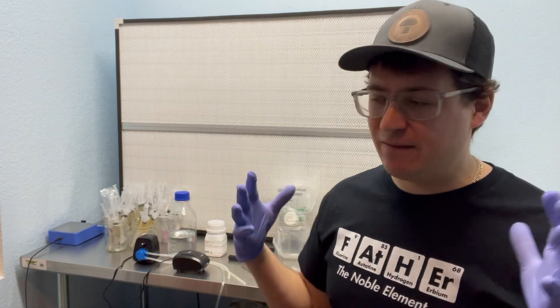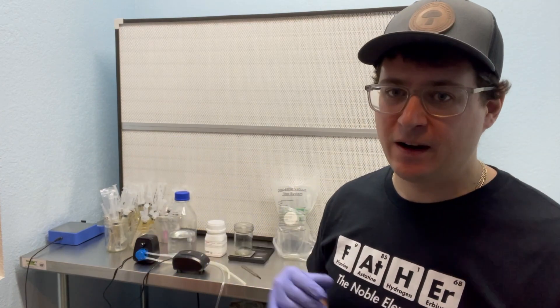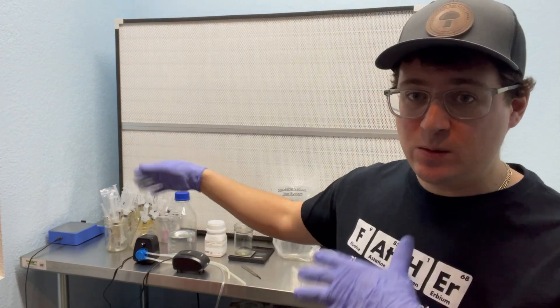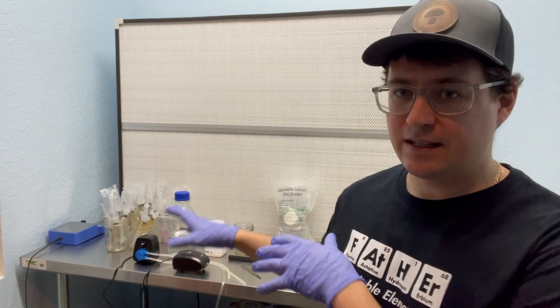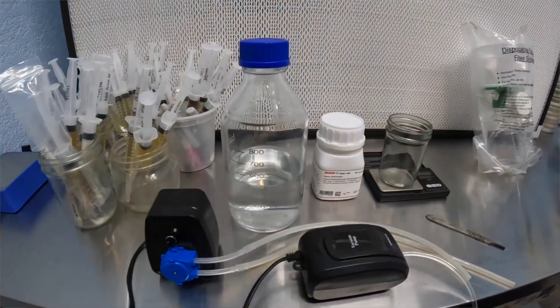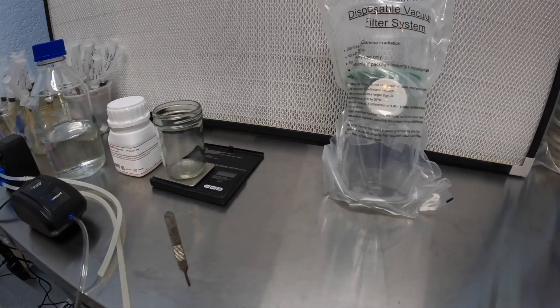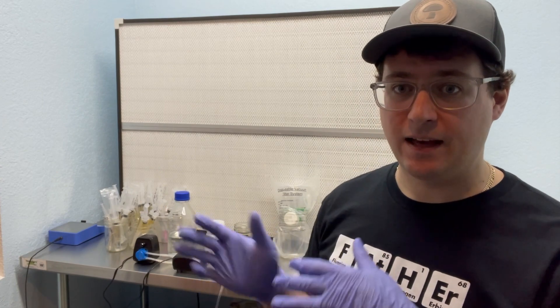There's plenty of ways on the internet on how to do this. You can try microwaving your liquid culture or whatever, but this is the best way to make a liquid culture and use it immediately without using a pressure cooker or an autoclave. I was doing this to run some LC tests over the summer. I'll be doing a video on that in the springtime once I get all of my tests worked out and some of the results.